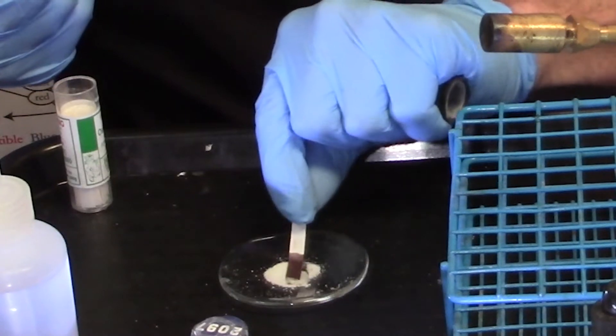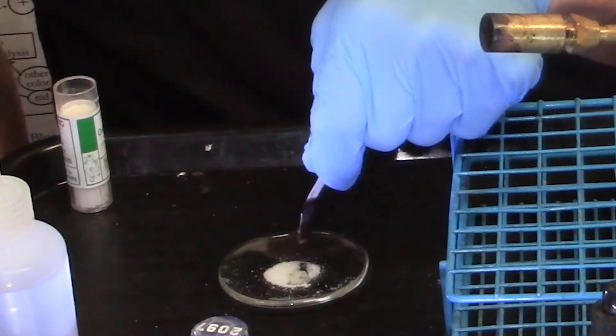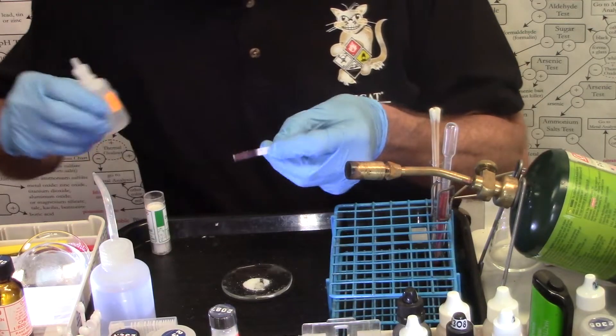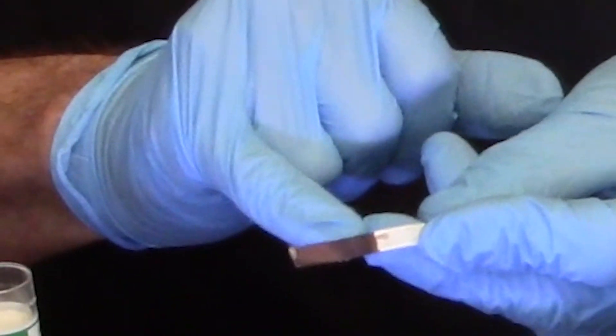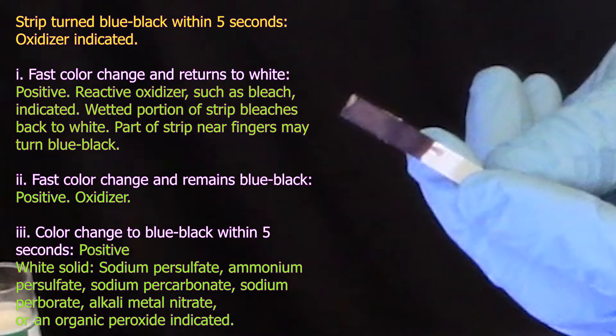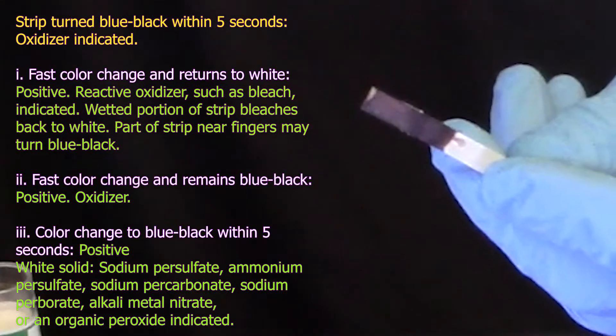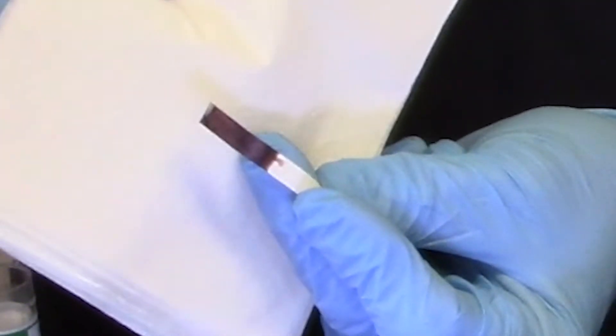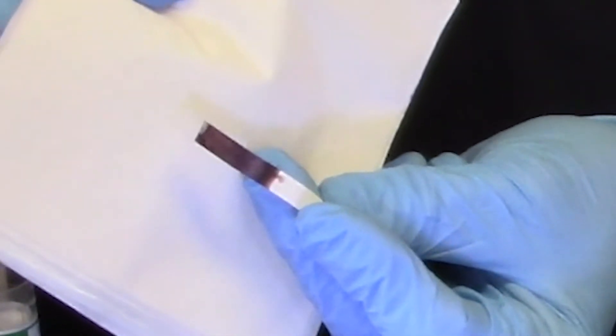One one thousand, two one thousand, three one thousand. Lift, look, and hold it above the watch glass for another two seconds. And we're looking for a deep blue black color, which is what we can see here on the oxidizer test paper. That's positive for an oxidizer if it happens quickly within, say, 15 seconds or so.